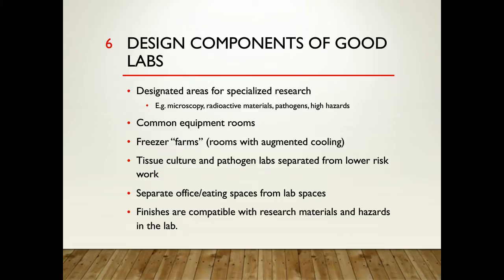And finally, you want to make sure that the finishes are compatible with the research materials and the hazards in the labs. Generally, lab benches are made from impervious materials that are resistant to acids and heat and other corrosive materials. And you want to make sure that the floor materials are also compatible with the materials and research that's going on.